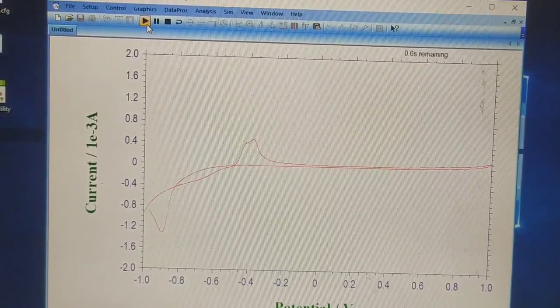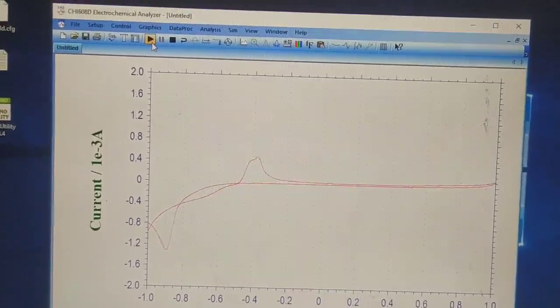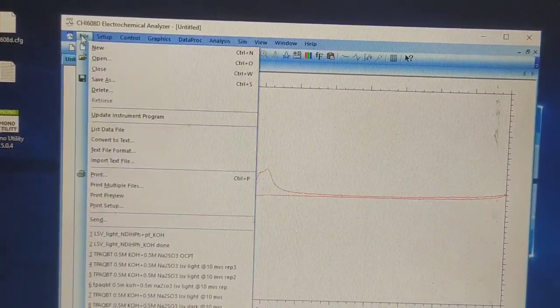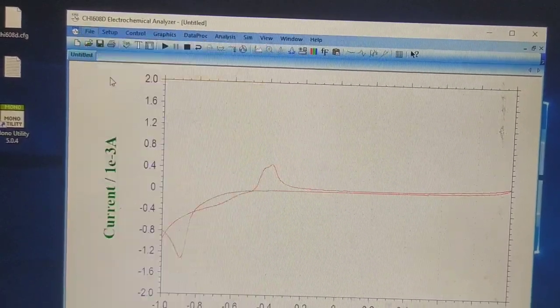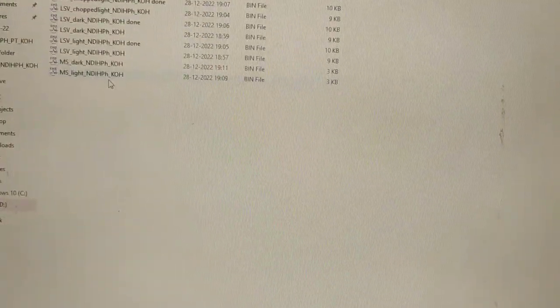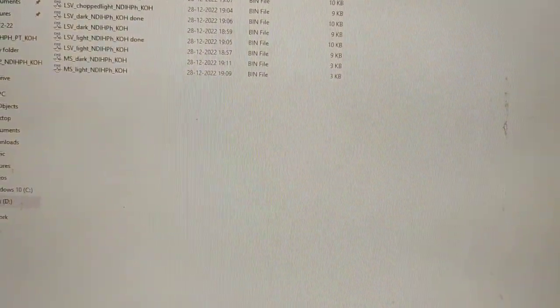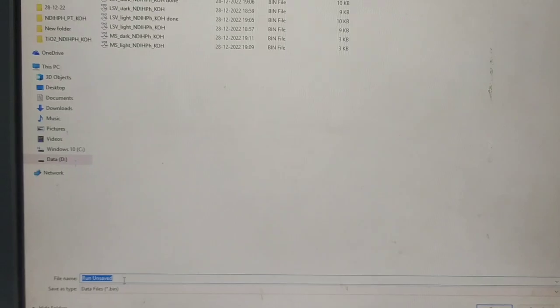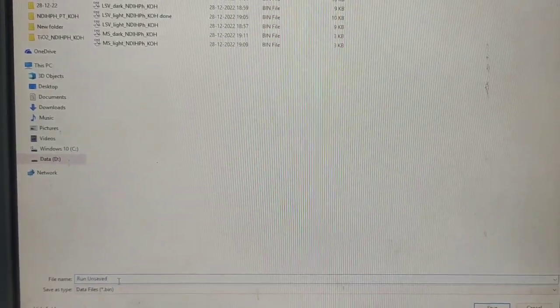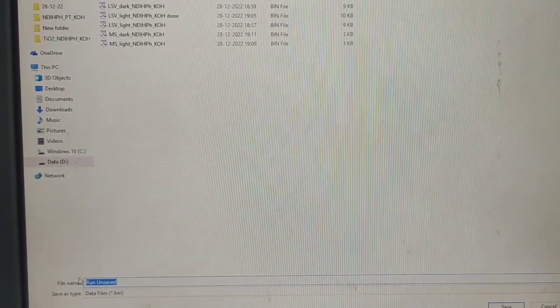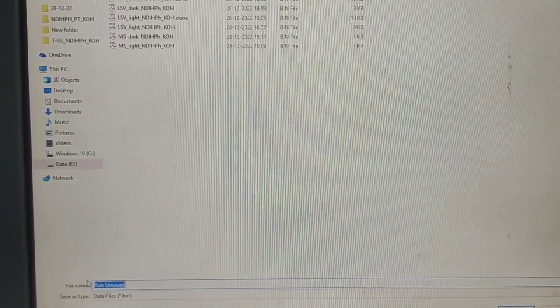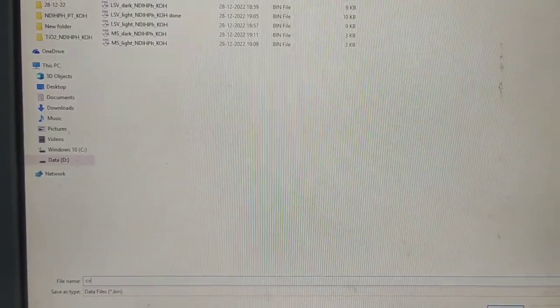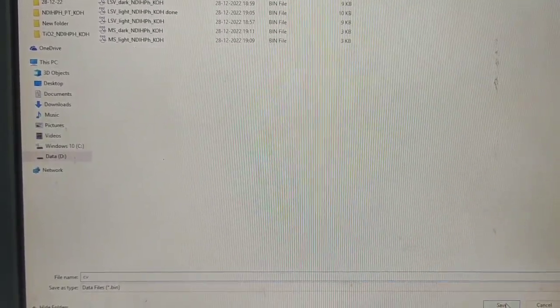This is the CV graph which has been recorded. Now we will save this graph — go to file, save as, and let's save this. We will give it the name CV and then save.